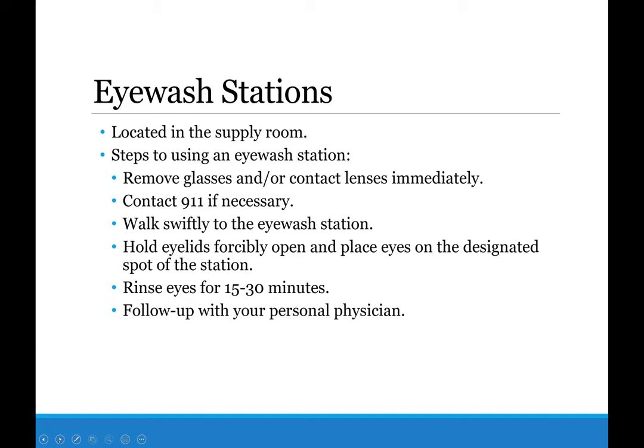Eyewash stations are used when chemicals get into your eyes. We should not be getting chemicals in our eyes because we should be using our chemical splash goggles, not safety glasses. If it does happen, immediately remove your glasses or contact lenses. We recommend not wearing contact lenses in the lab — if you're working with something exothermic, it can weld to your eyeball. Someone should contact 911 if necessary. Hold your eyelids forcibly open at the eyewash station and rinse for 15 to 30 minutes, then follow up with your personal physician.